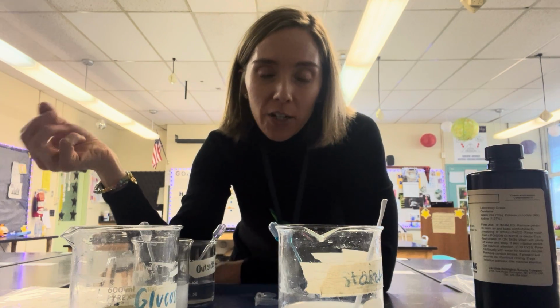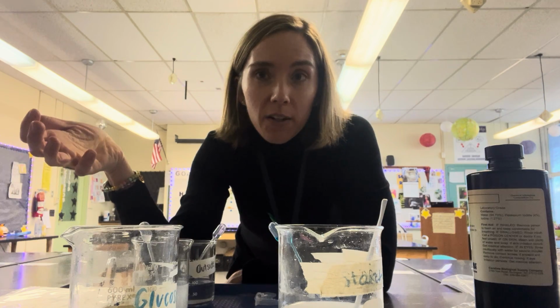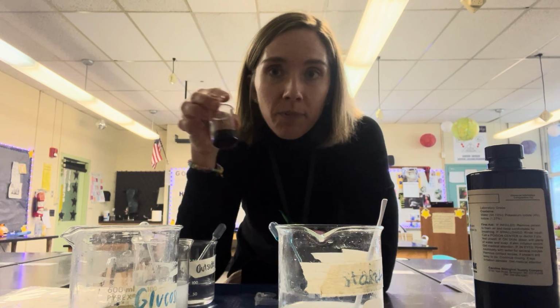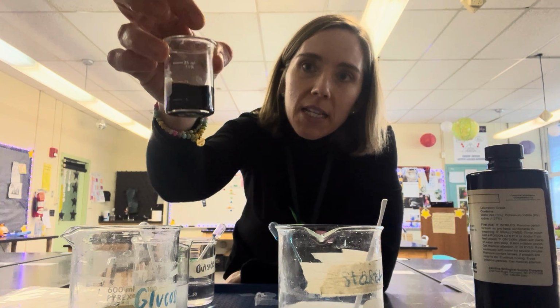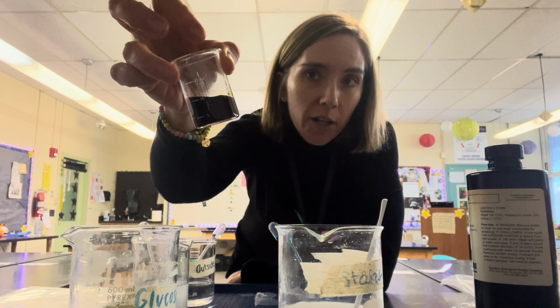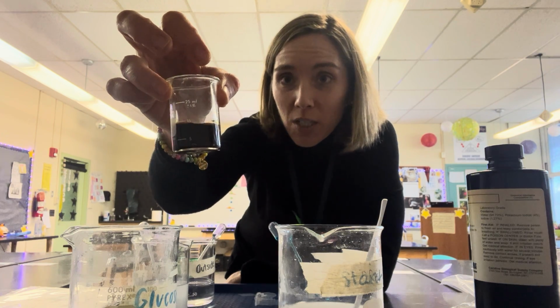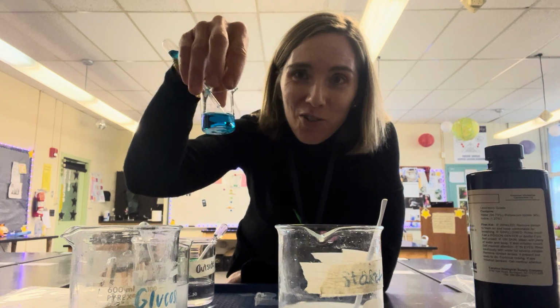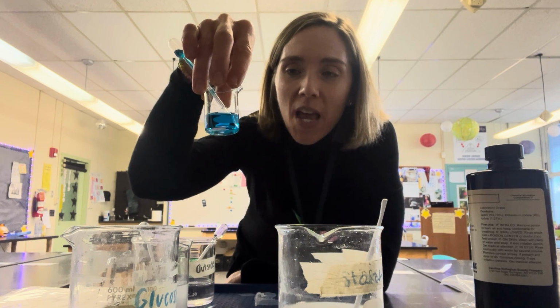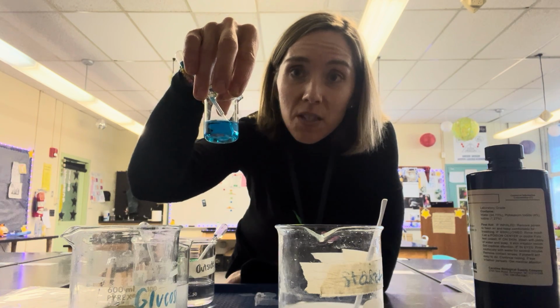We're going to use indicators. Indicators are substances that change color in the presence of other chemicals. Iodine is an indicator for starch. On its own, iodine is kind of like a brownish orangish color, same when you mix it with water, but when it identifies starch, it's going to turn black in color. Benedict's solution is an indicator for glucose. On its own it is this bright blue color, but if it detects glucose, it's going to turn an orange color.